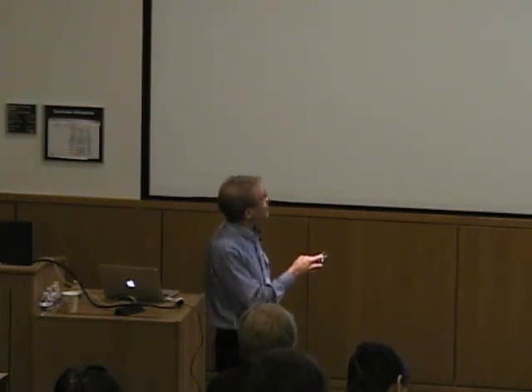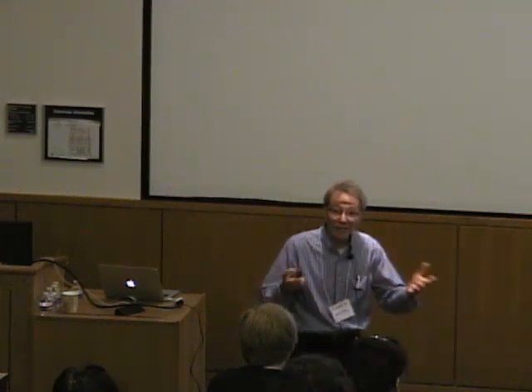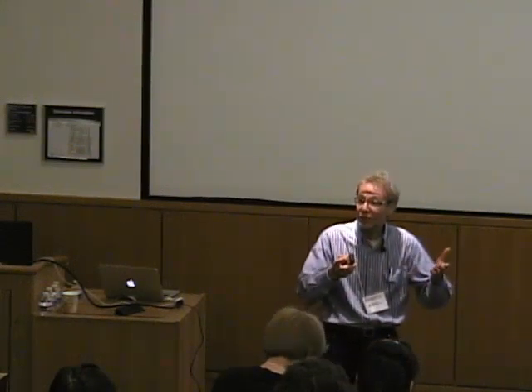Now I step back and say, let's think about it, okay? What about the stoichiometry? Is it what I expected? What about the injection peaks? Do they look like I'm capturing all the heat of each injection, okay? Is the data within the C window? Is there enough heat? If there isn't, you maybe need to increase the concentration. If there's plenty of heat, lower the concentration. Get more data out of that precious sample that you've prepared.